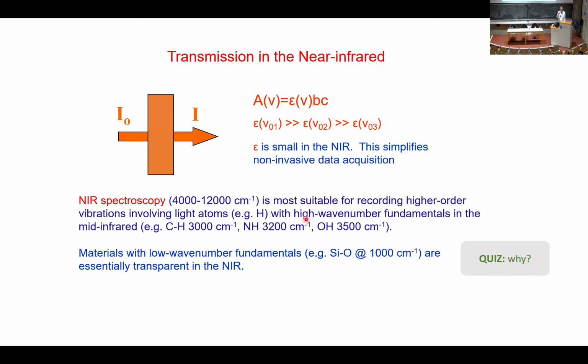We knew there was water on Mars long before the vehicles, the rovers, went up there and made spot measurements. We knew that because clay minerals were detected, and clay minerals are only made in the presence of water, and that detection was by near-infrared from the reflected light. Sun as a source, and we measure the reflected light.